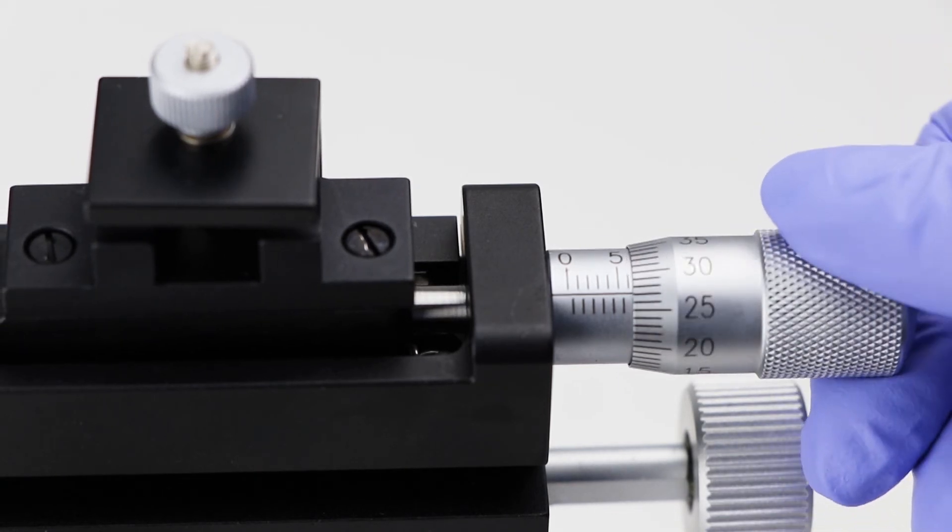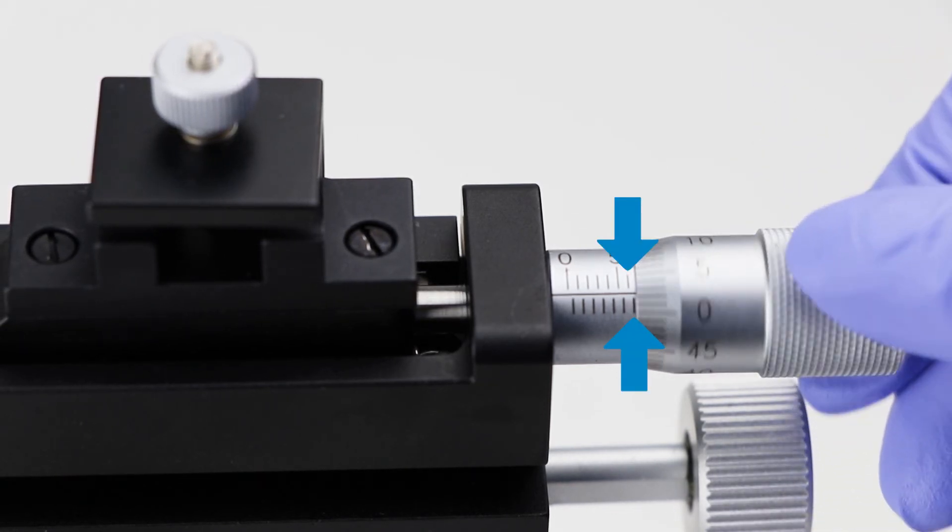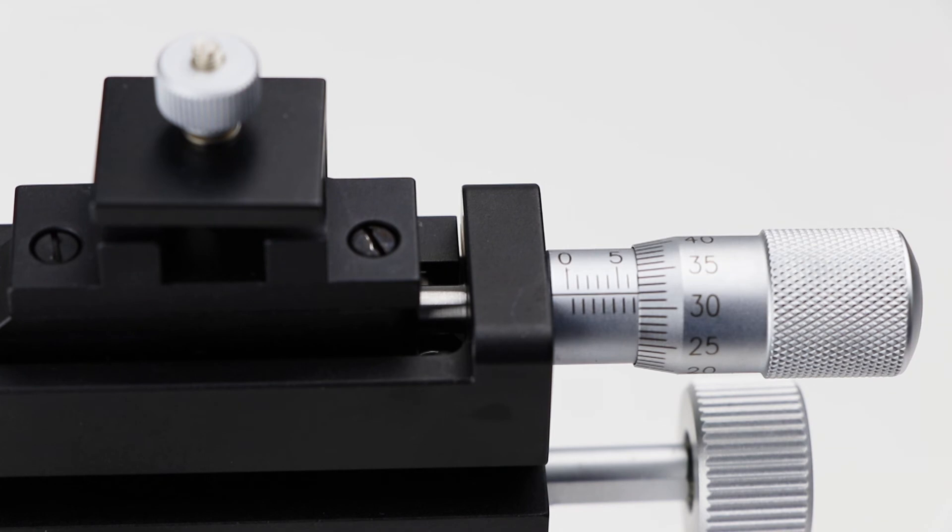This time, 6.5 is visible on the linear scale. On the rotational scale, you can read 32, which is equivalent to 32 hundredths of a millimeter. Add these two values together to get your measurement. 6.5 plus 0.32 equals 6.82 millimeters.